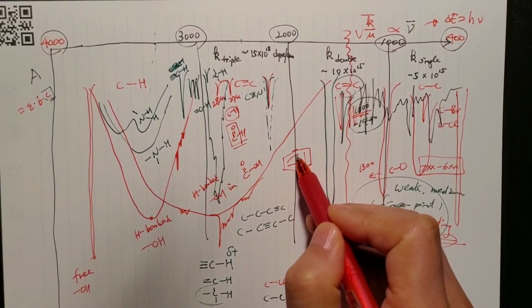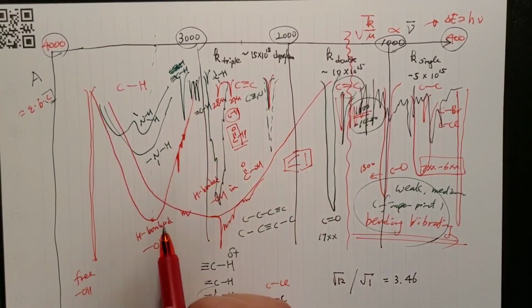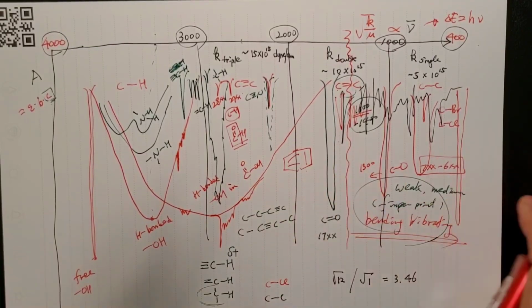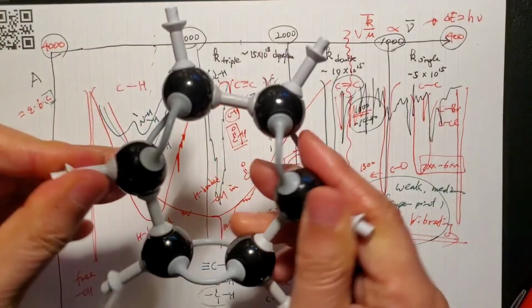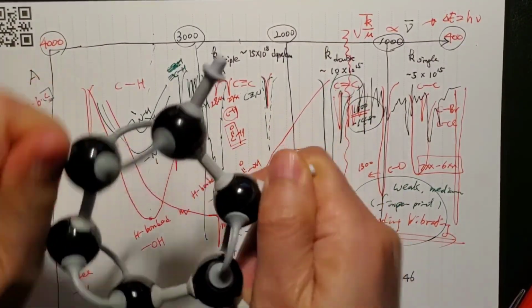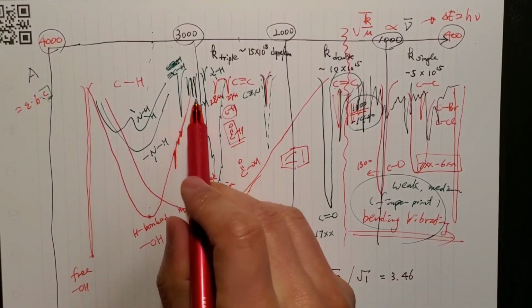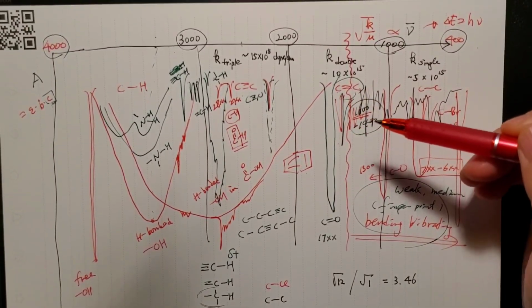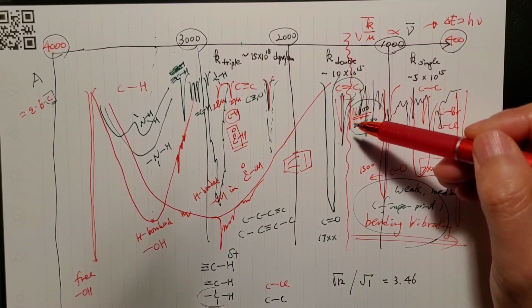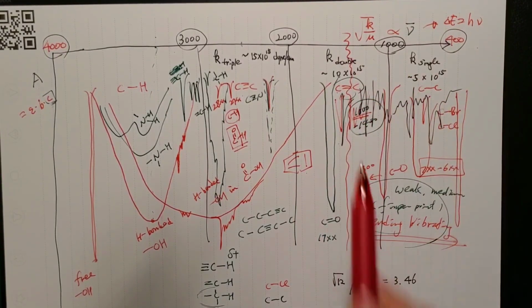It's not because you have many CHs, each giving one signal, right? As a group, these hydrogens have many different vibrational modes. Yeah, so that's the signal you find here. Even the many CC double bond peaks here are also collaborative bending or stretching vibrations that give signals here.